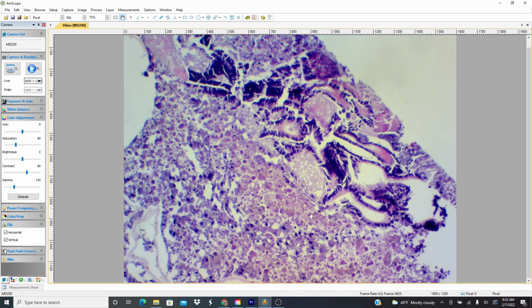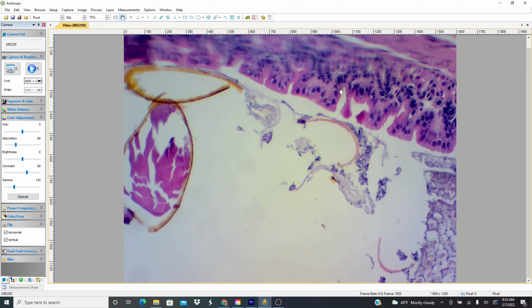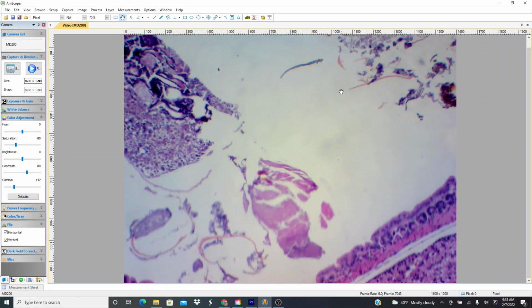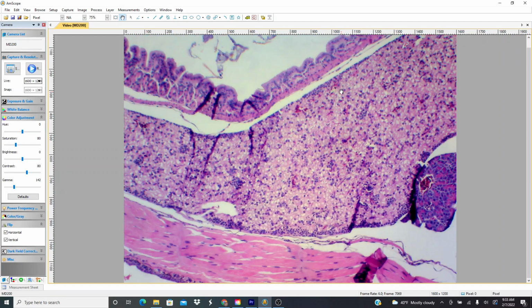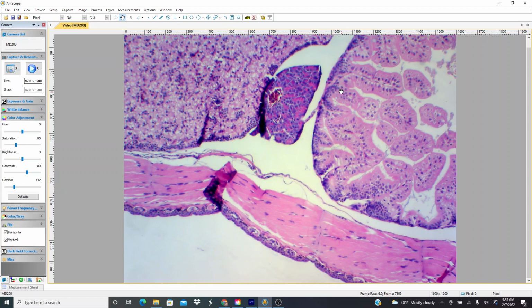These sort of things look like glands, these empty spaces lined by these types of cells. I don't know if that's a gland or something that it ate. I have no idea. This is fascinating to me. I've been waiting a long time to have a look at what is inside of little animals. It actually started with me wanting to look at a jellyfish because I figured a jellyfish wouldn't have many cells at all in it. And I still don't know the answer to that.